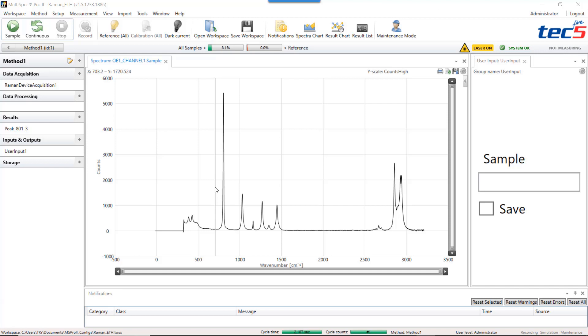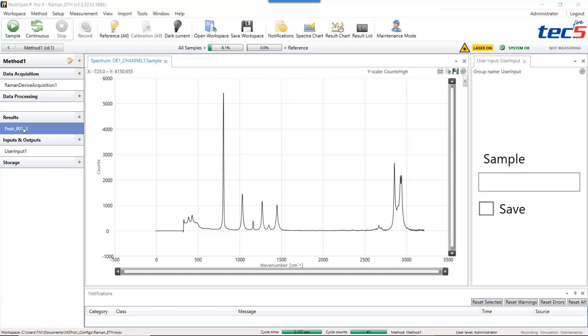I already created a result which is Peak 801_3 and you can learn how to do this in a separate tutorial. In addition I have created a user input which I can show to you in some of the next tutorials.